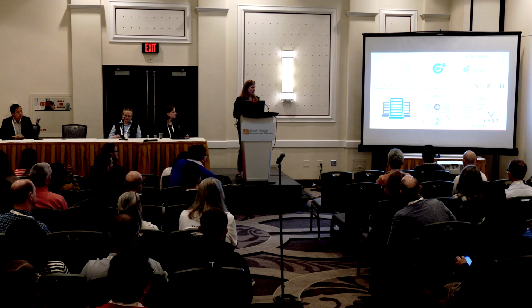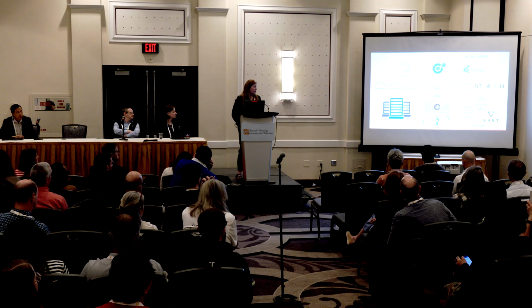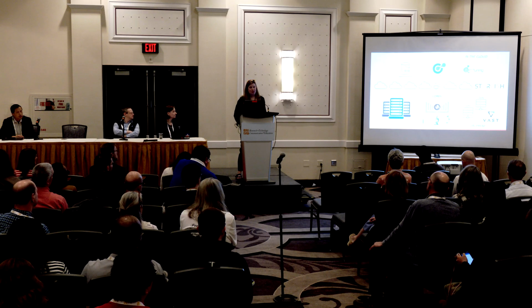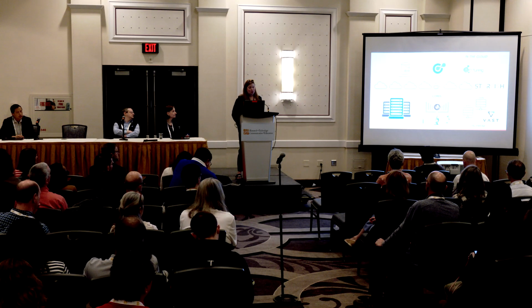So how is our data management set up? We have the cores at Salk, where we're generating sequencing data, microscopy data, flow data, mass spec data, all kinds of other data. And then we have a bunch of different storage systems: DDN, Ceph, VAST. We have a couple petabytes of storage, including about 1 petabyte of genomic sequencing data that we've acquired over the last 20 or so years that we manage for everybody.